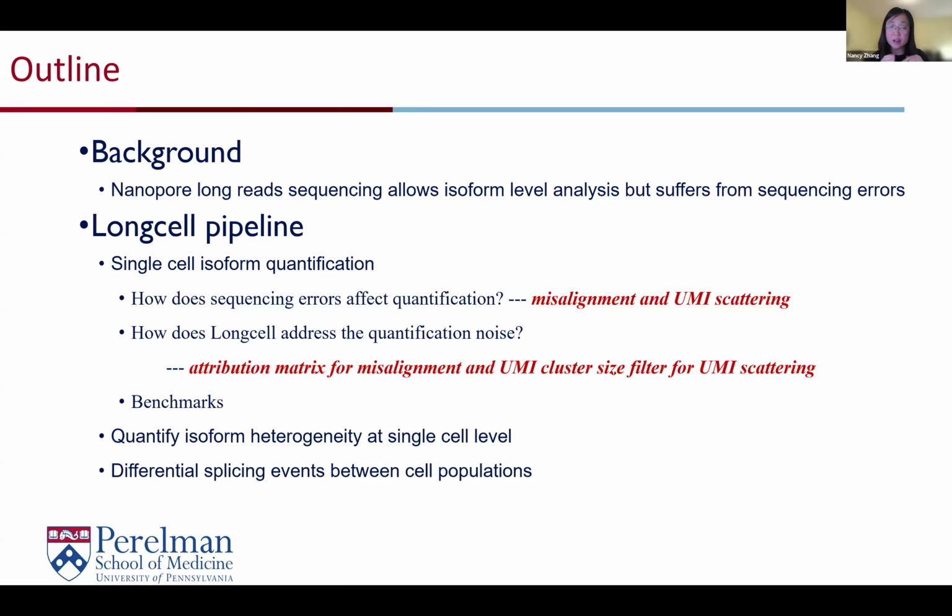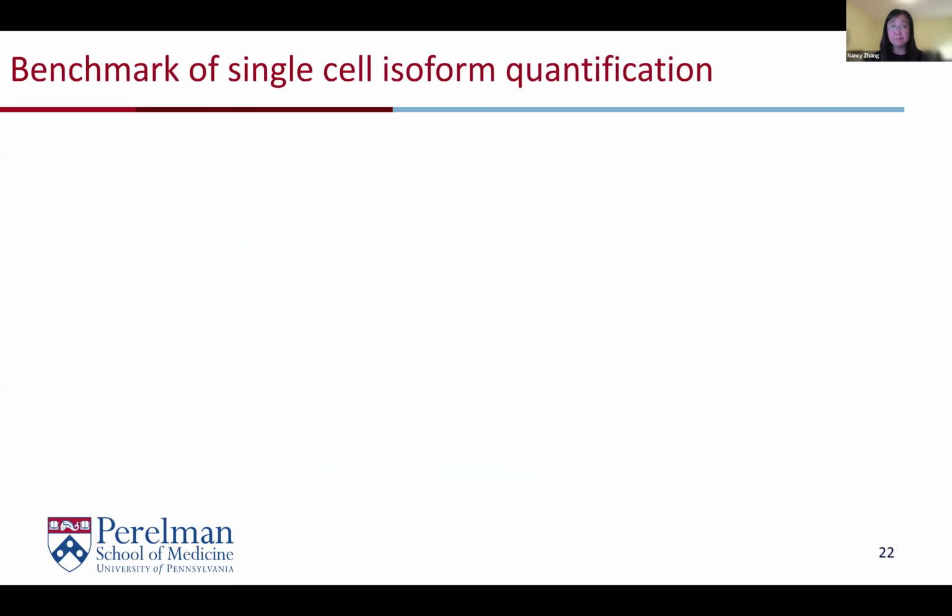And also, I just want to emphasize that in data, we don't know what the PCR amplification fold is for each gene. You see that this noise property actually depends on the gene's initial expression as well as its PCR amplification fold. And those are 2 things we don't know. So it's very hard to correct for them downstream. So you have to do this in the pre-processing step.